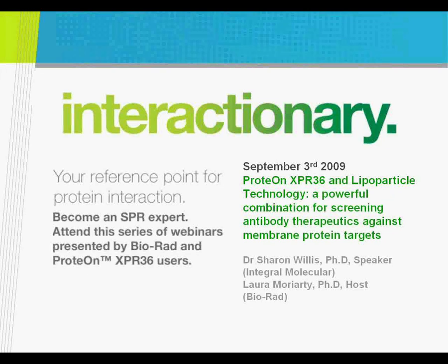Oh, that's really interesting. I just had another question about the assay development. How hard is it for you to decide on which is the best capture? Because you talked about capture earlier on. I wondered if you had any guidelines that might help people who are perhaps not using your specific capture method, but perhaps using protein A or an anti-IgG or an anti-Fc.